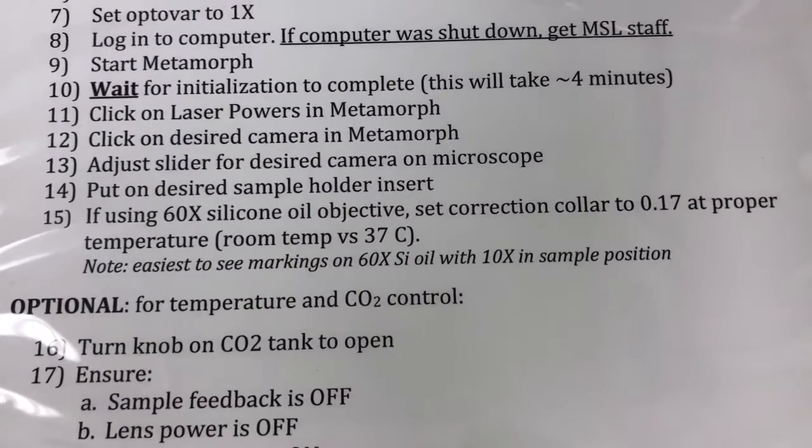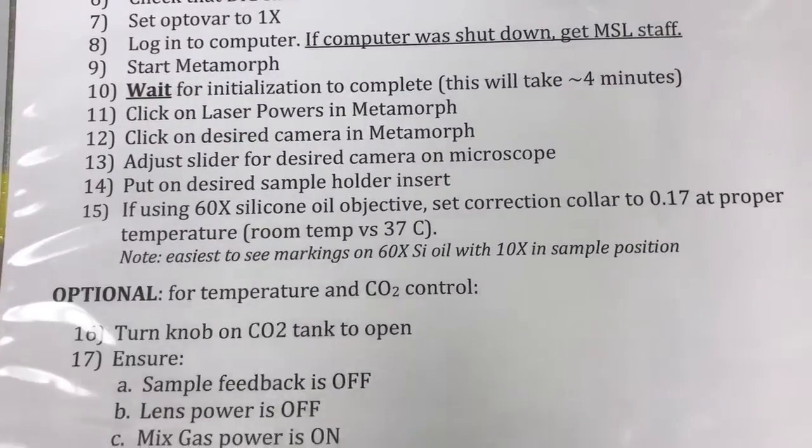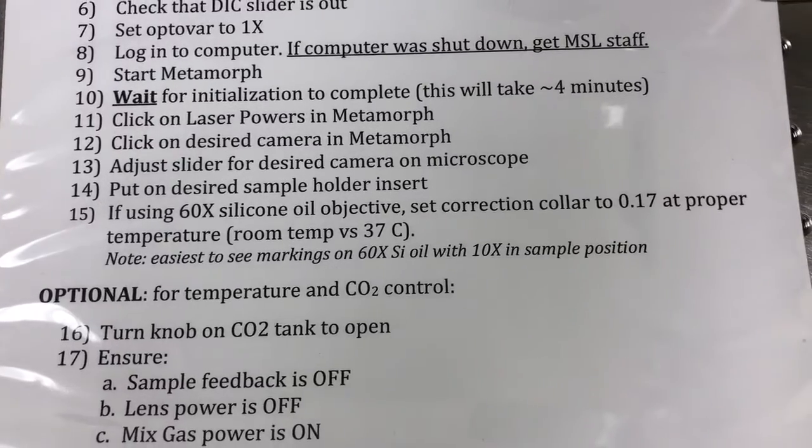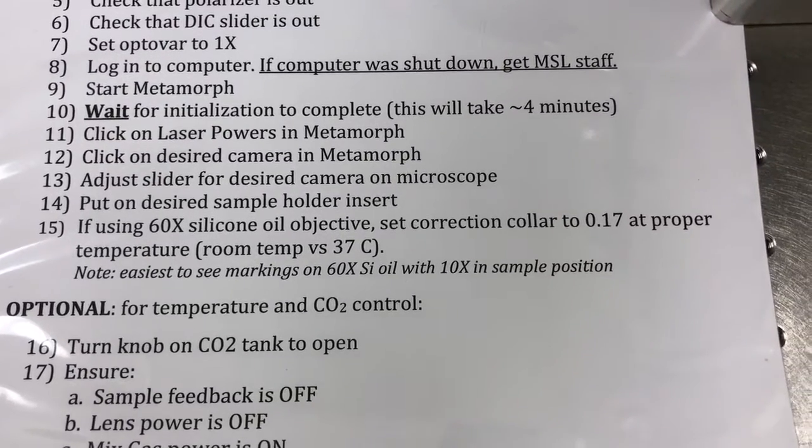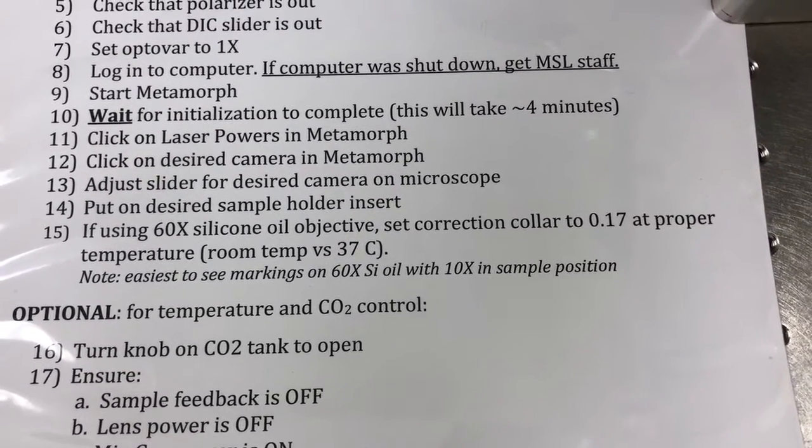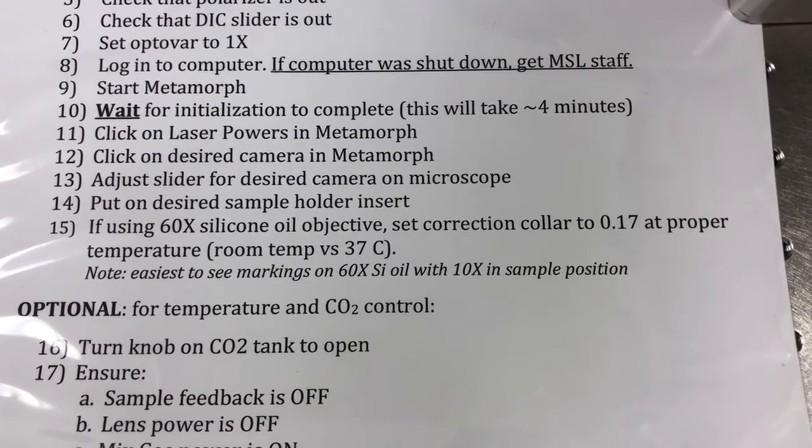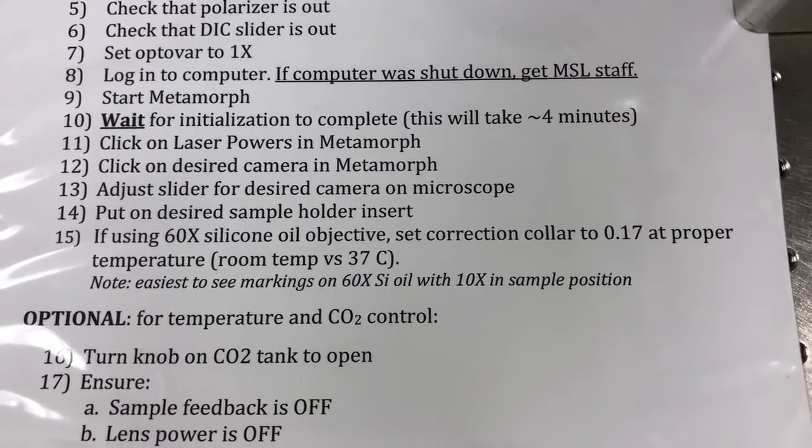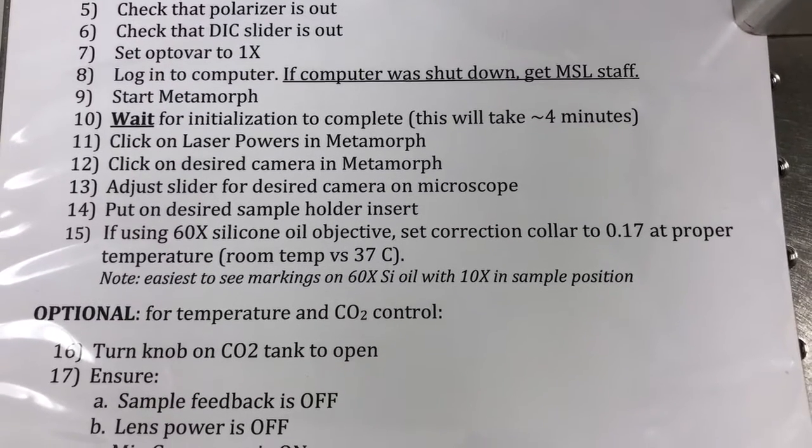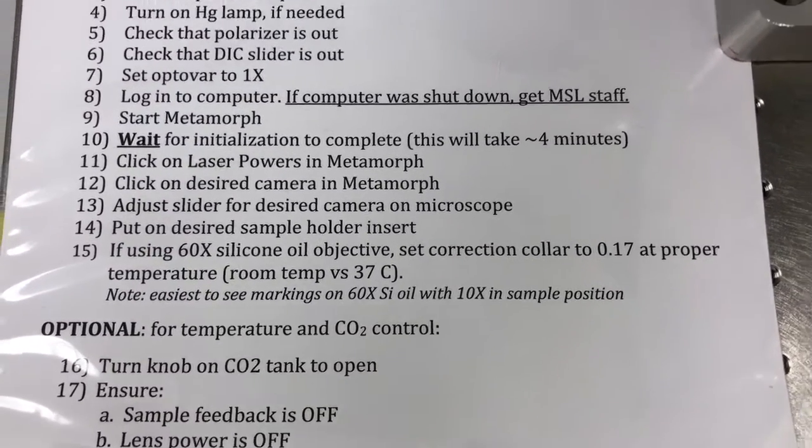The next step, 15, is if using the 60x silicon oil objective, set the correction collar to 0.17 at the proper temperature, which can be either room temperature or 37 degrees Celsius. It has a note that it's easiest to see the markings on this objective with the 10x in the sample position.